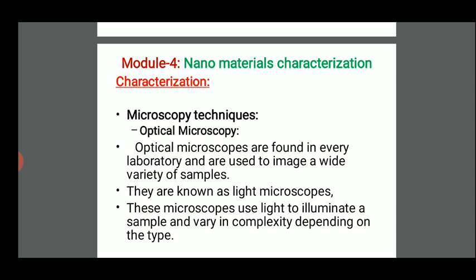Magnification is possible up to 1000 times, and the very best resolution possible is about 200 nanometer. Actually, this 200 nanometer is more than the dimensions of most of the nanomaterials. So when nanomaterial characterization is considered, this optical microscopy is not of much importance.